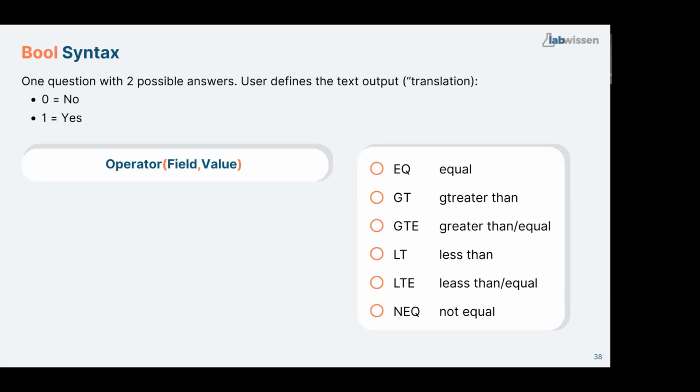How would it look if corrected amount check is empty? Stefan, thank you for this question. So you will get an empty field, and if your custom field couldn't be calculated, you will get a certain peak code or result code starting with C. So in your Empower help, if you go to the peak codes, this is this letter and number, you will see there is a separate area of codes with C. They all refer to calculations of custom fields. So if a custom field couldn't be calculated, you also get an extra code, either by peak code or by result code.